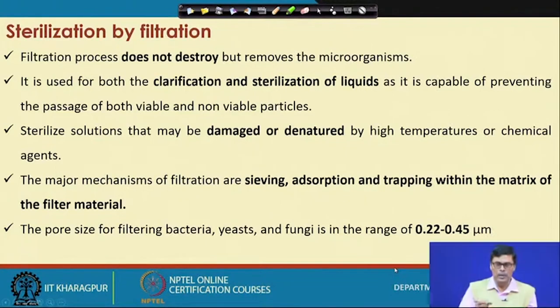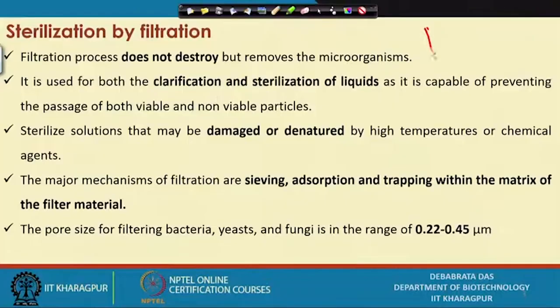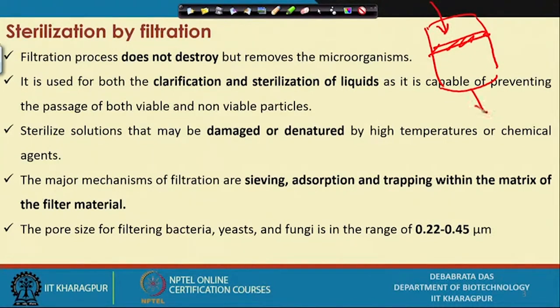Now, sterilization by filter. Let me tell you why we don't generally use the filtration technique for medium sterilization. Again, it depends on the type of fermentation you are looking for. Suppose I use some kind of membrane filter, am I right? In the case of a membrane filter, this is the membrane, and you want to pass your material from one end and take out the material from the other end.